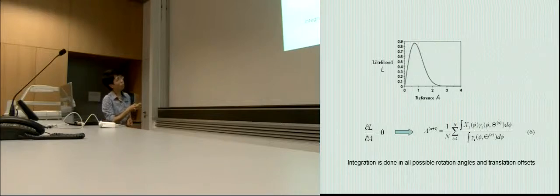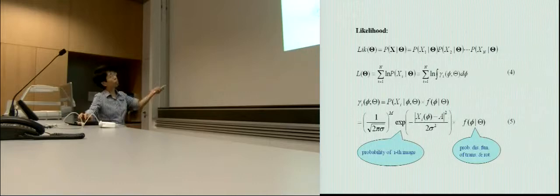So as a result, we just look at the result. Here the structure will be, you see here is a sigma, a summation, and in the summation we have integration. Each particle xi contributes to the final structure in multiple ways. Here is the weight. Gamma is the weight, and it is defined using this equation 5.